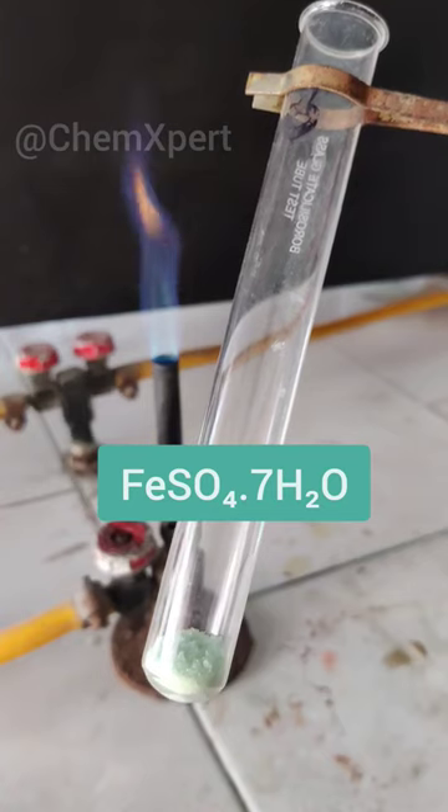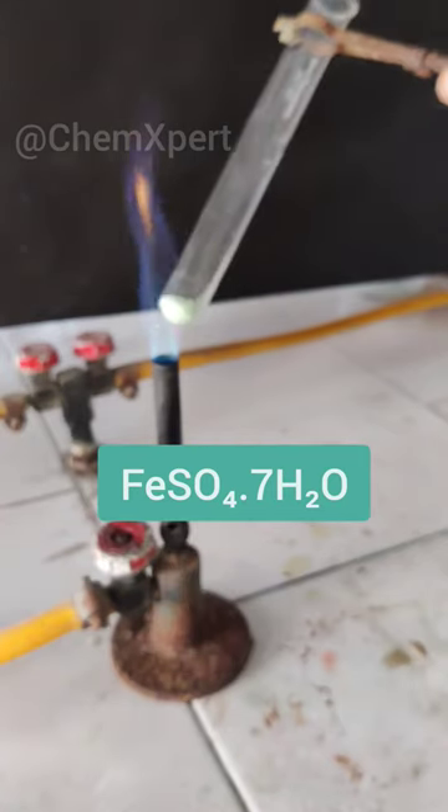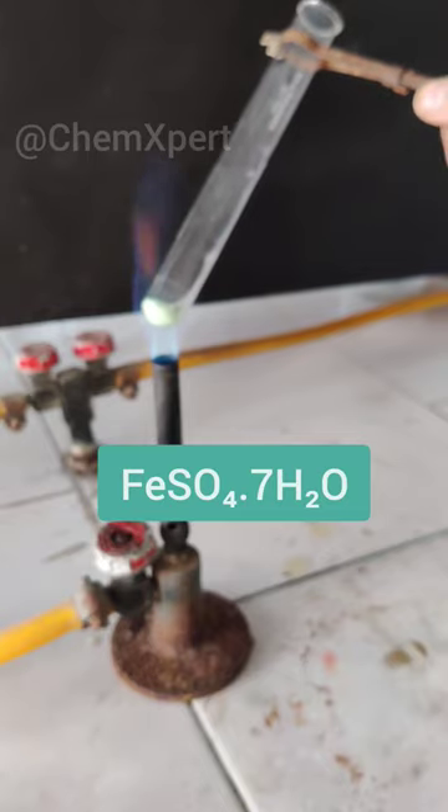What happens when you heat ferrous sulphate? Ferrous sulphate crystals are FeSO4·7H2O, and it is light green in colour.